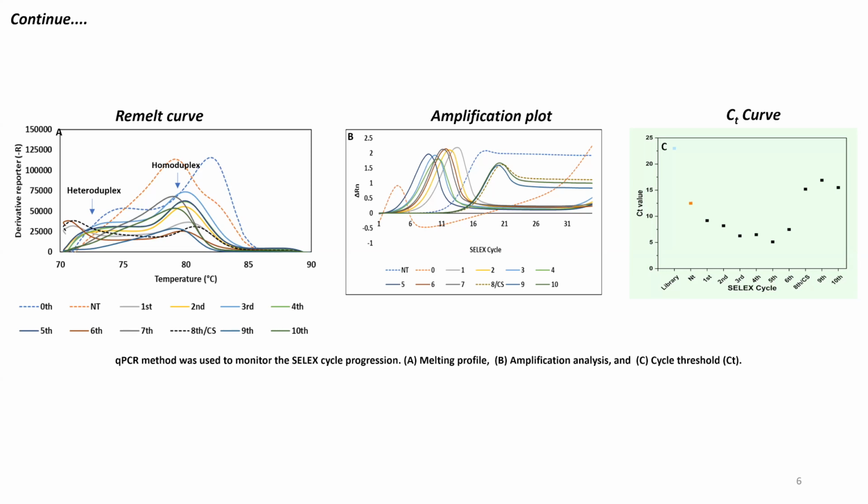After that counter SELEX, we perform two more cycles, and there is now a gradual decrease in the CT value, which shows that there are still aptamers that bind to the small molecule.